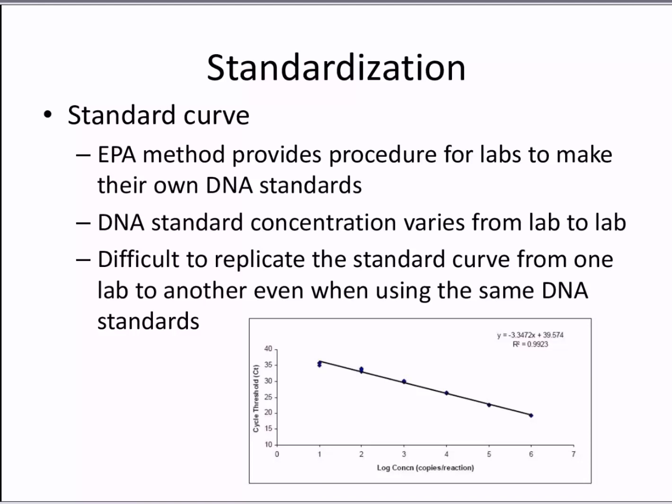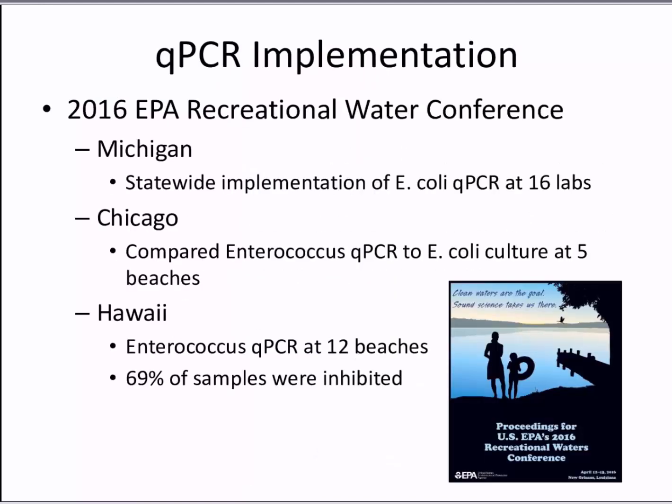So now switching to qPCR implementation. Again, like I said, in 2012 qPCR was approved by the EPA. In 2016, the EPA had the Recreational Water Conference in Louisiana, and these were some of the presentations given on what these labs' experience was in implementing qPCR.